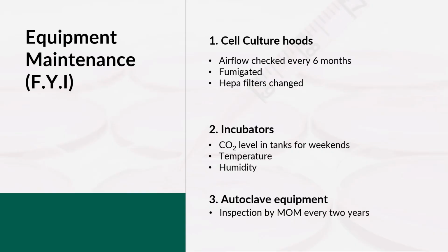So there are appropriate cleaning agents that you can use by following the manufacturer guidelines to prevent damage to the equipment. The third point about the autoclave is the water quality. You have to ensure that the water being used in the autoclave meets the manufacturer's specification for quality. Because if you use poor water for sterilization, it can lead to mineral buildup and corrosion within the autoclave, which will then affect its performance and lifespan.